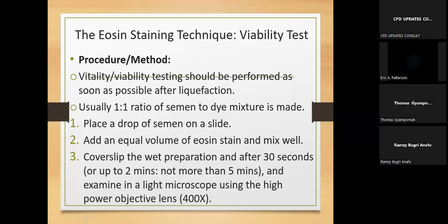some of the, what do you call it? Sperms staining pinkish, some being colorless. Those who are colorless are alive because they are not dead. They will not allow the stain to come in and stain it.